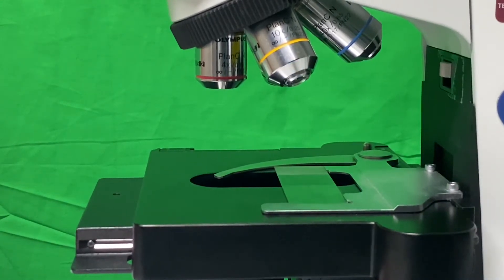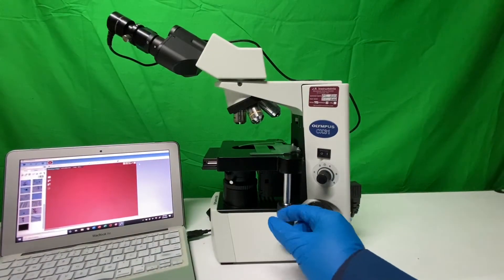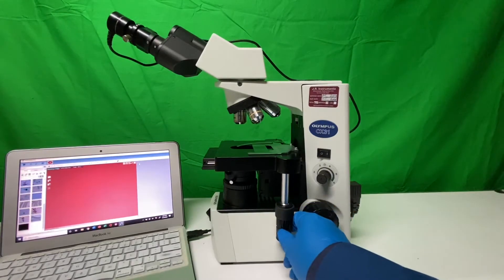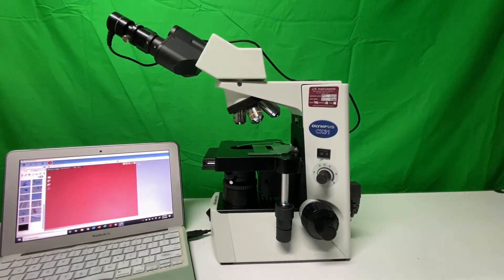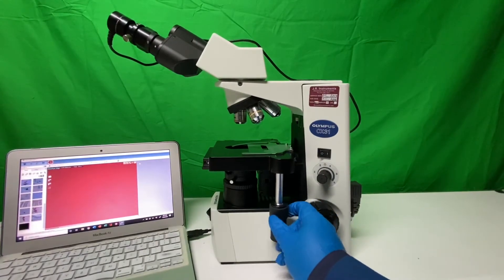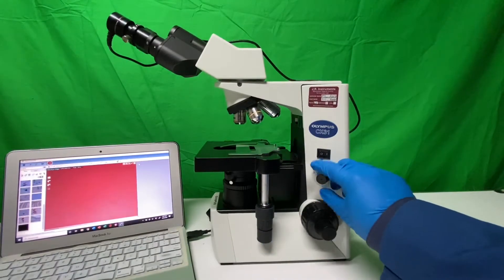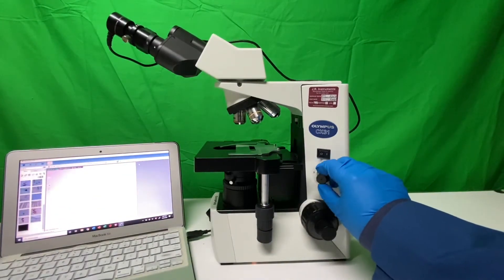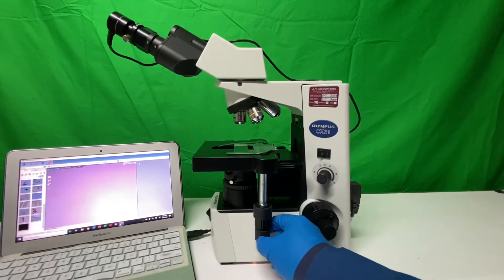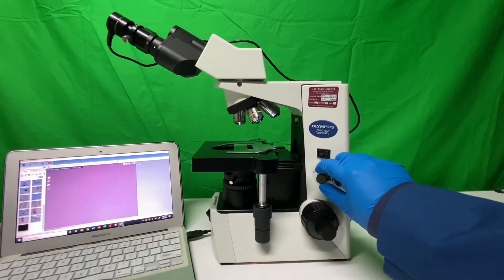Using the X and Y stage maneuvers: the Y control gives us up and down movement, and the X control gives us the side-to-side effect. We're going to center this slide over the light — you can usually tell by a little reflection of light coming through. I'll turn up the light so you can see it pass through, and we'll look for the image we're interested in.